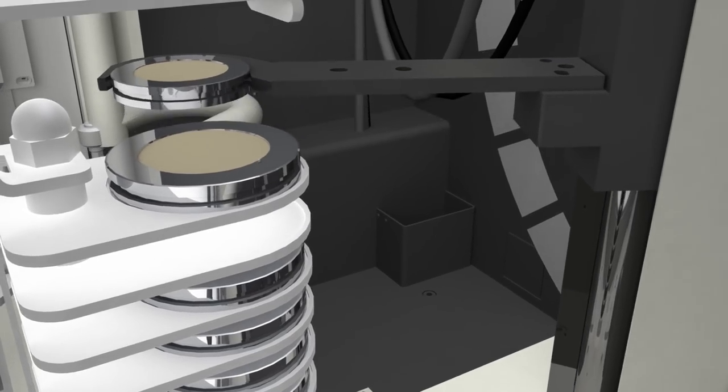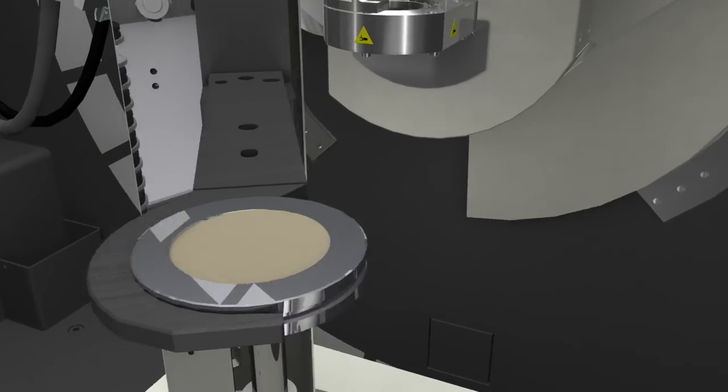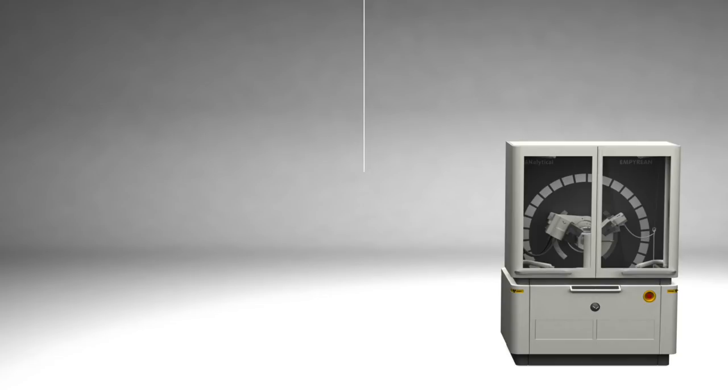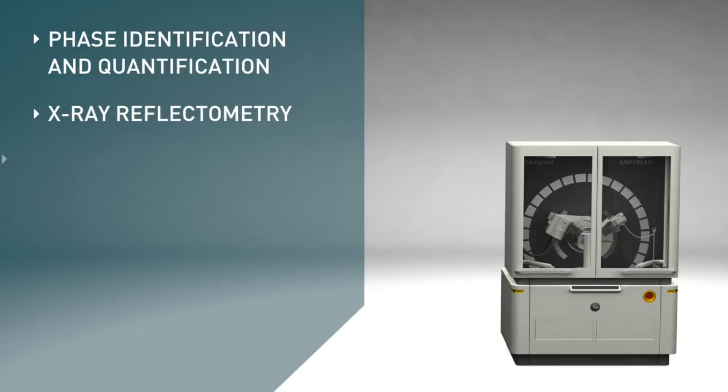The new Empyrean is the first fully automated multipurpose x-ray diffractometer. Users can perform a large variety of measurements without any manual intervention.